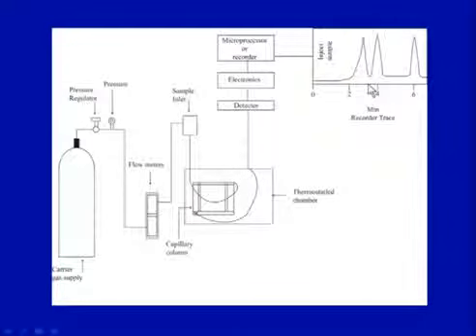Even for an unknown sample, you can make a standard curve, or you can run standard compounds, and then you can plot it like we have seen in other chromatographic techniques, and then the unknown sample retention time could be calculated from that.